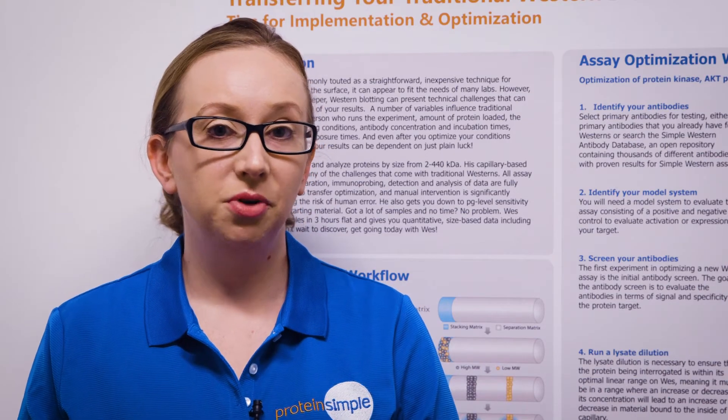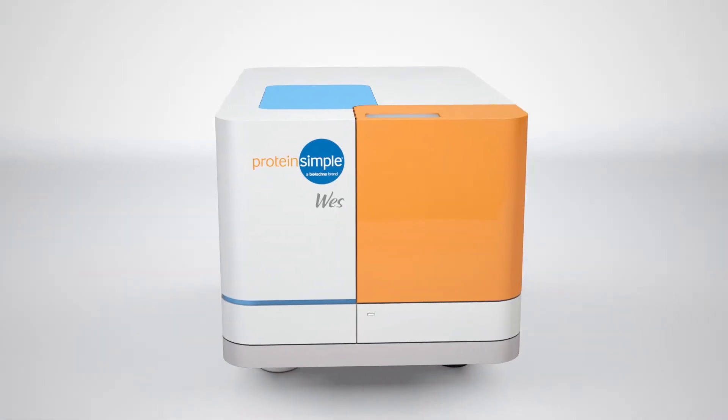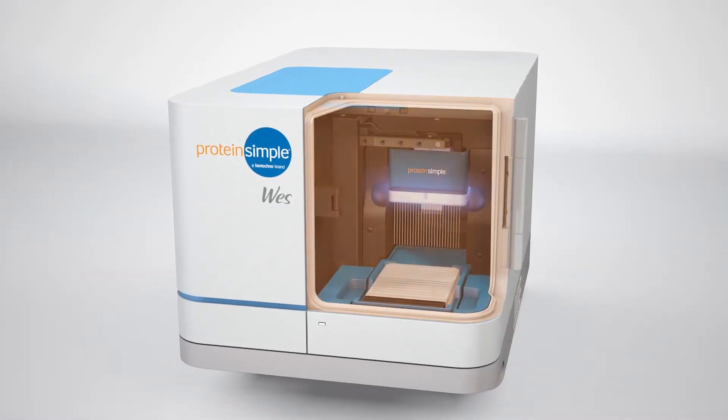Wes can run 25 samples in 3 hours, giving you quantitative, size-based data, including total protein. Now I'll walk you through what happens inside the Wes instrument.